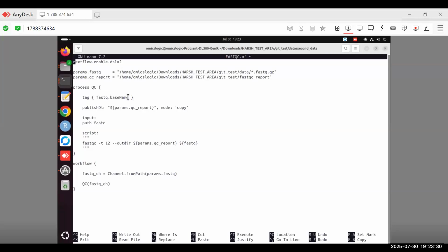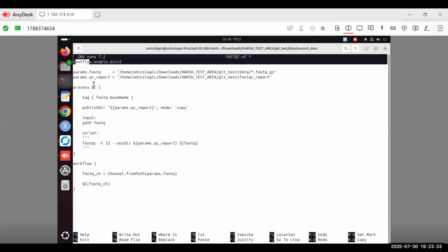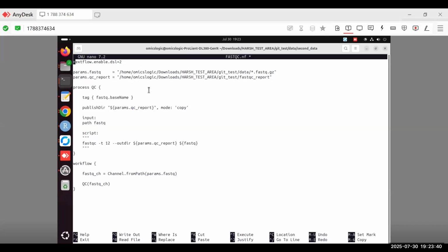Now, whenever you prepare a script, the very first thing is that you have to define nextflow.enable.dsl = 2. What does it mean? It means that we are enabling Nextflow DSL2, which is going to support modules and give a more structured workflow in the coming steps. So the first thing is all about enabling it. Then next here you can see params. params dot, how do you pronounce it, params, we can say it like that.